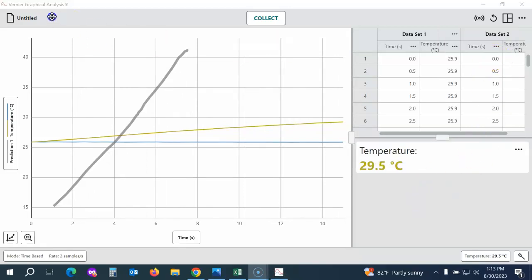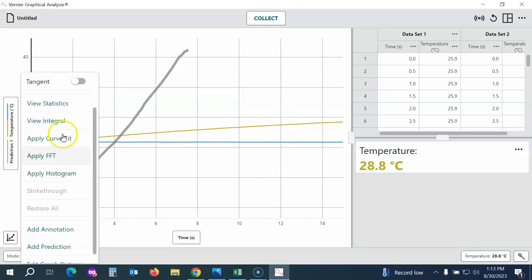The data table shows all the data that was collected along the way, and the meter shows the live temperature reading for my sensor. To analyze my data, I can click down in the lower left corner on Graph Options. I can view statistics for the entire data set, find the slope of the line, or do a variety of other data analysis.